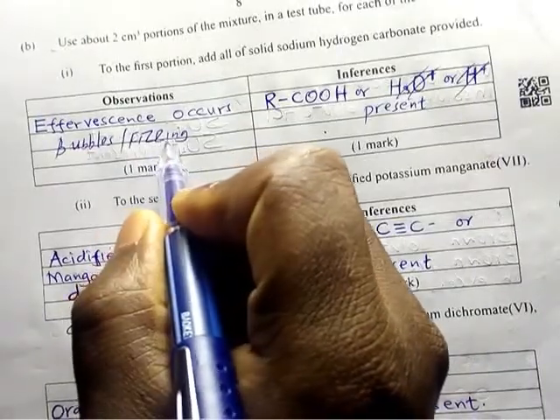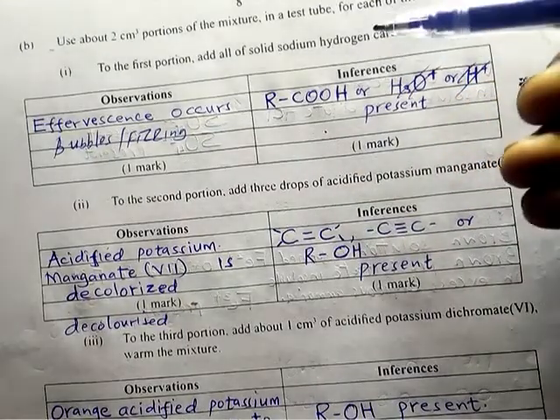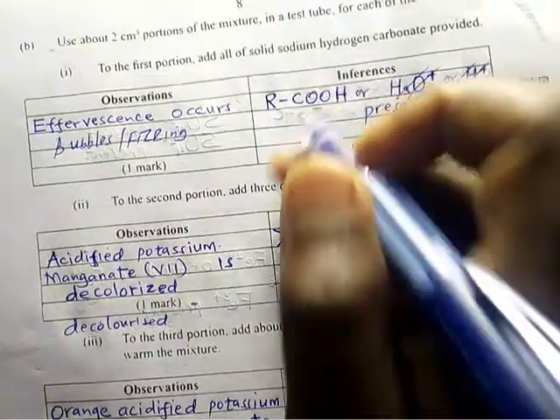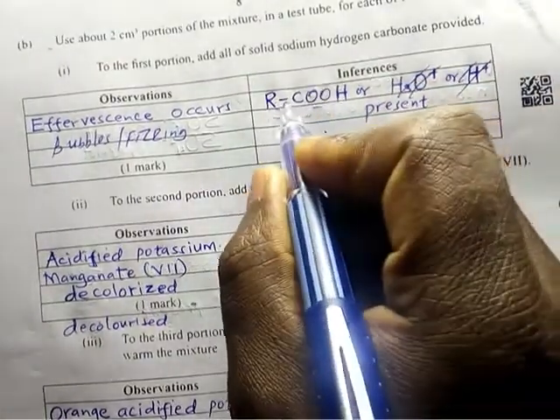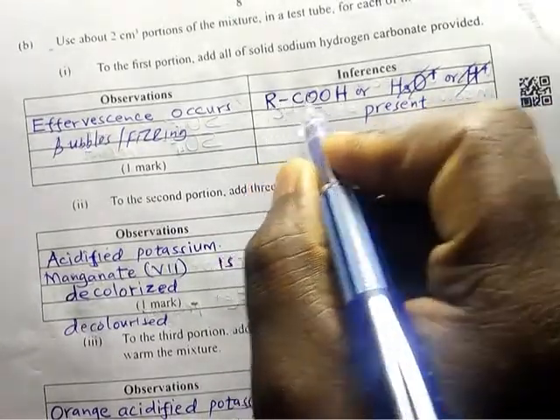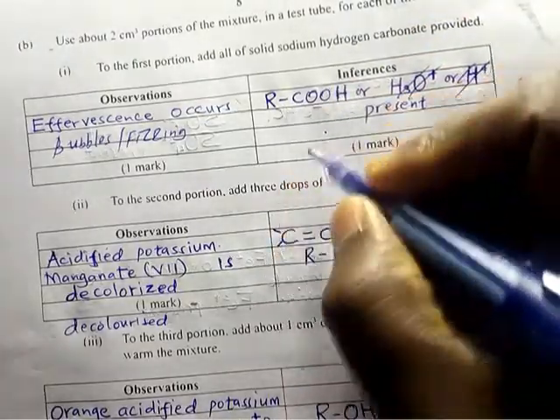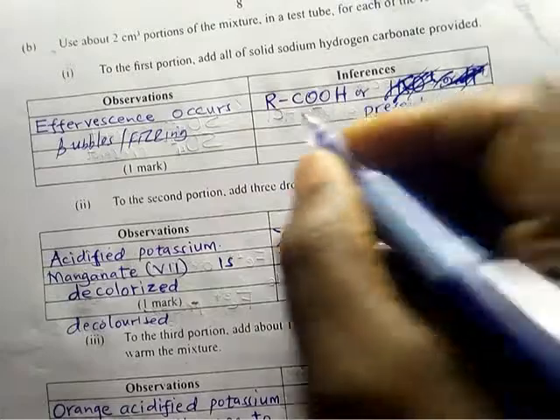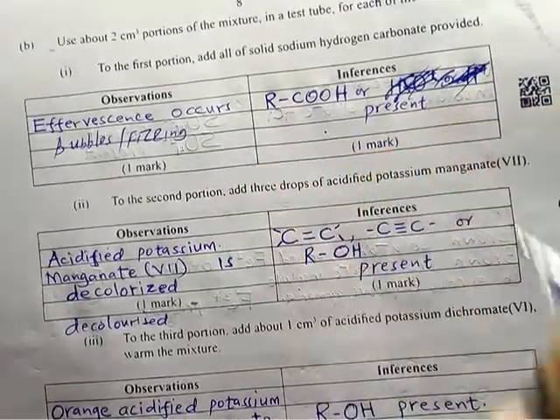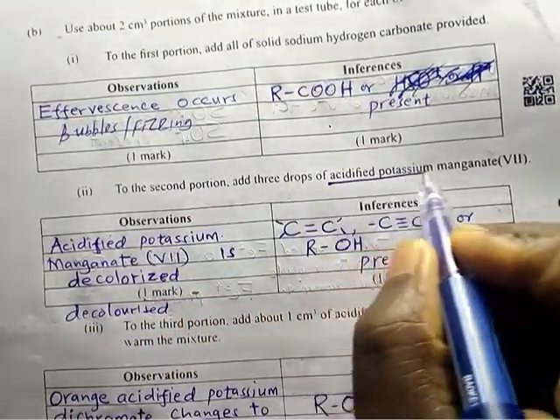Whenever fizzing occurs, it means the sodium hydrogen carbonate has reacted with an organic acid, and we represent organic acids by R-COOH, like ethanoic acid, propanoic acid. Because we are in organic chemistry, let us just use this. So you write R-COOH present.